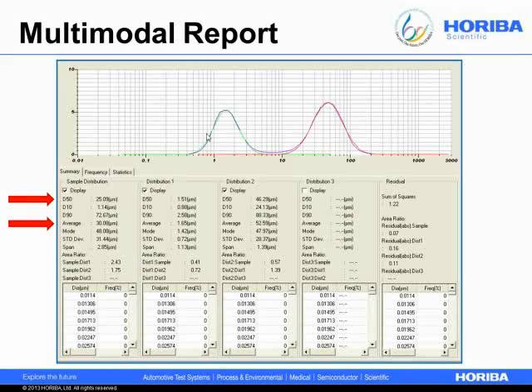Now, is this really the material that you want, or do you really just want this primary dispersed, or maybe the primary mode with a small, manageable tail of coarse material? In a lot of cases, this is what the person on the buying end actually wants. It's just the singly dispersed material, which is why if you look at the D50 and the mean value for a bimodal material, it can oftentimes be misleading.